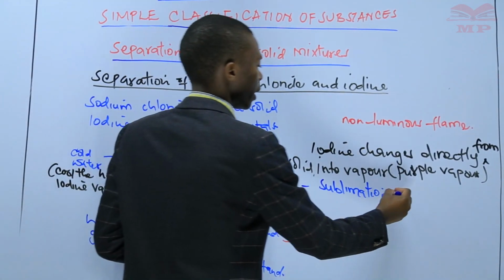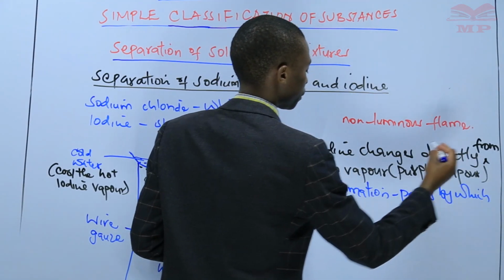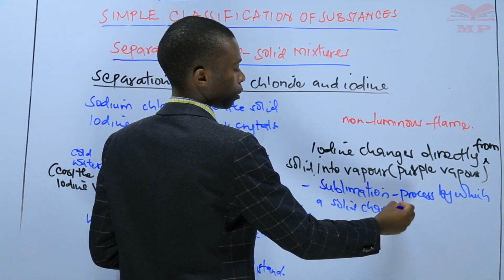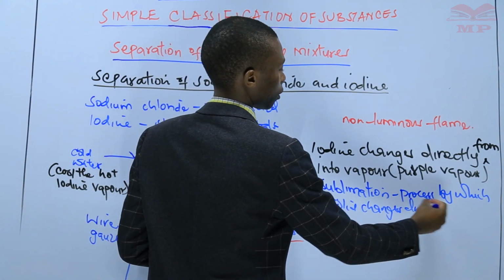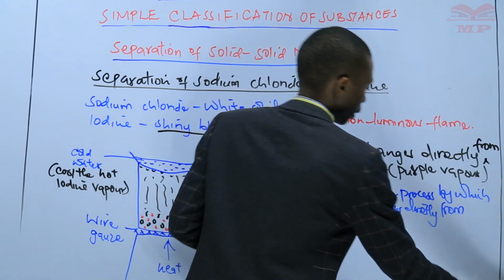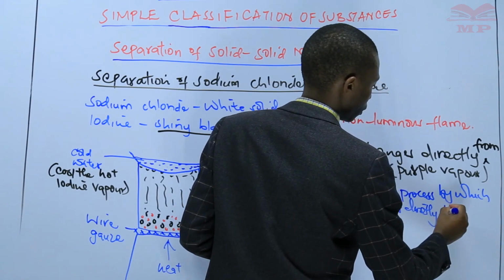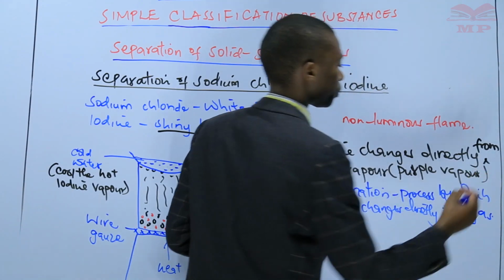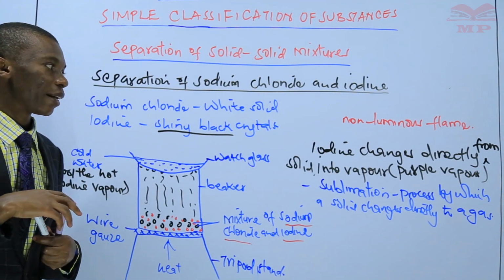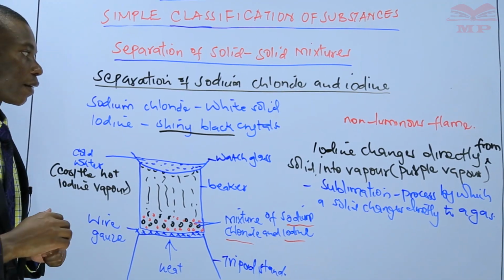Therefore, sublimation is a process by which a solid changes directly to a gas.